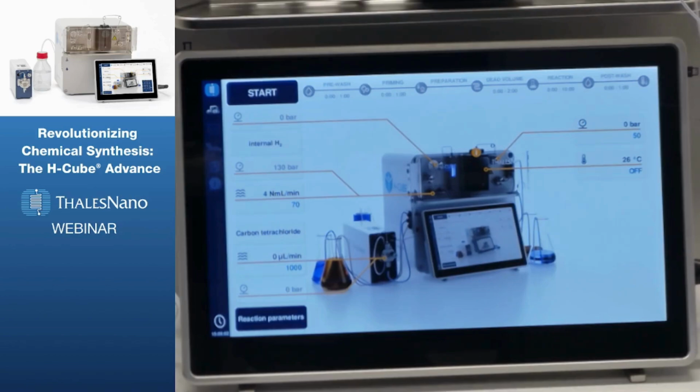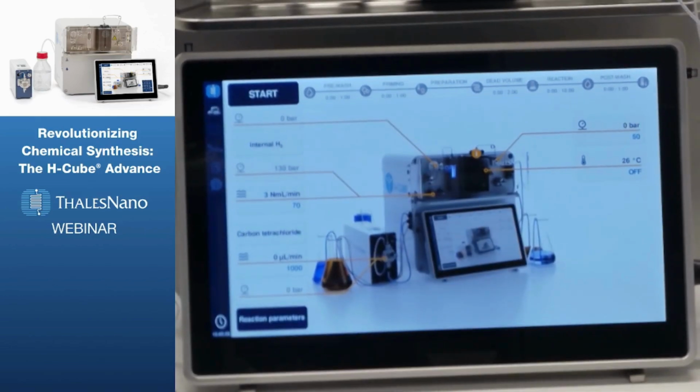You can also operate the pump using the second window of the main screen, so you don't have to use the manual buttons of the pump. It's perfectly possible to operate the pump using the automated screen as well. And you can also control the mass flow controller, so you are dosing the gas and the liquid from pretty much the same place at the same time.